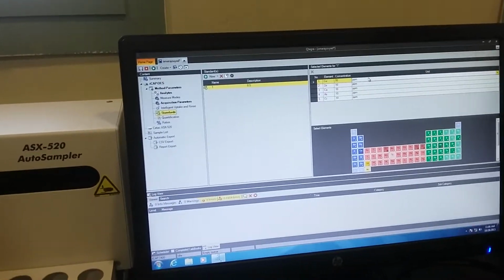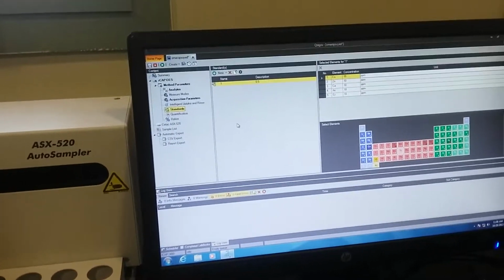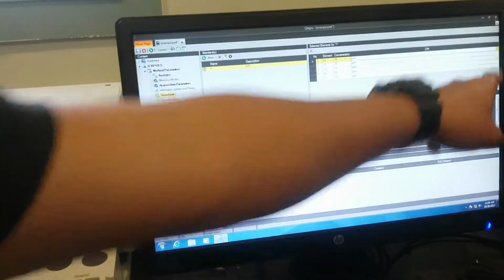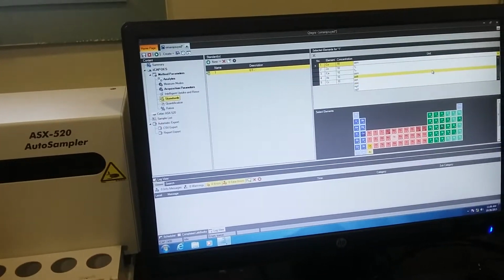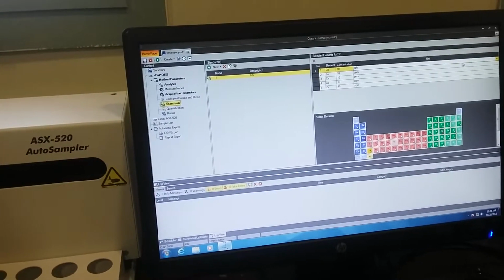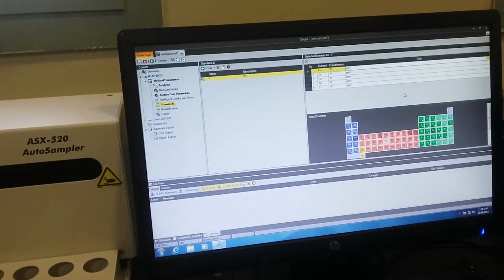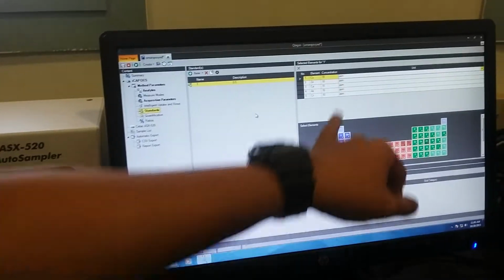You can possibly change the unit to PPB. You can make it PPB. You can see if you click here, you see it, right? As you like. But I think it's better to use PPM. Yeah, it will be a big number if you make it PPB. So PPM.